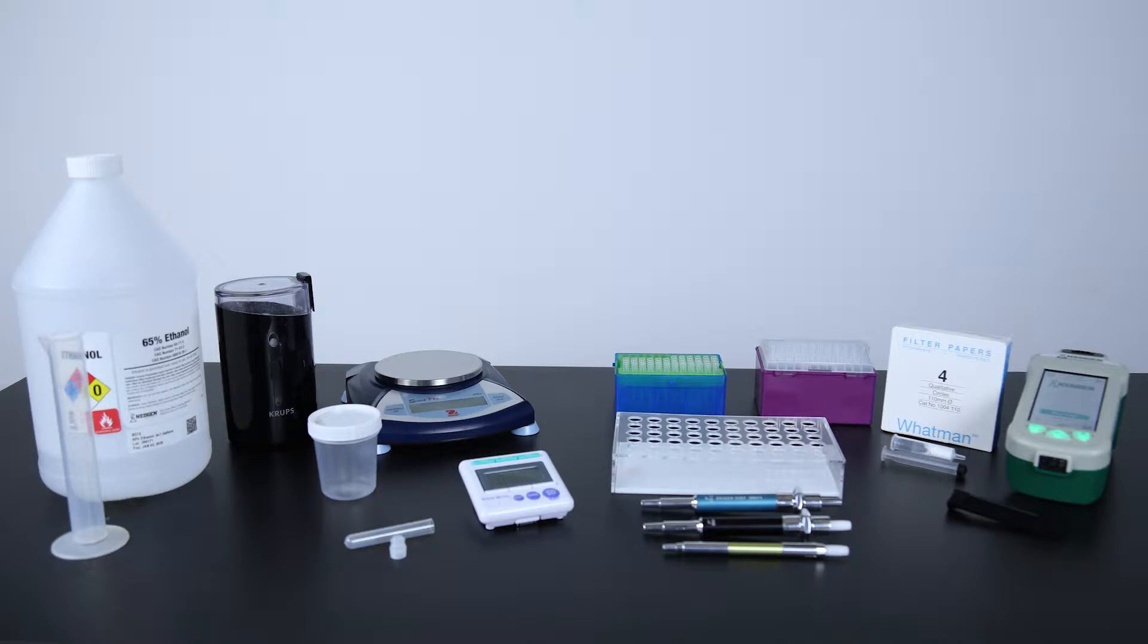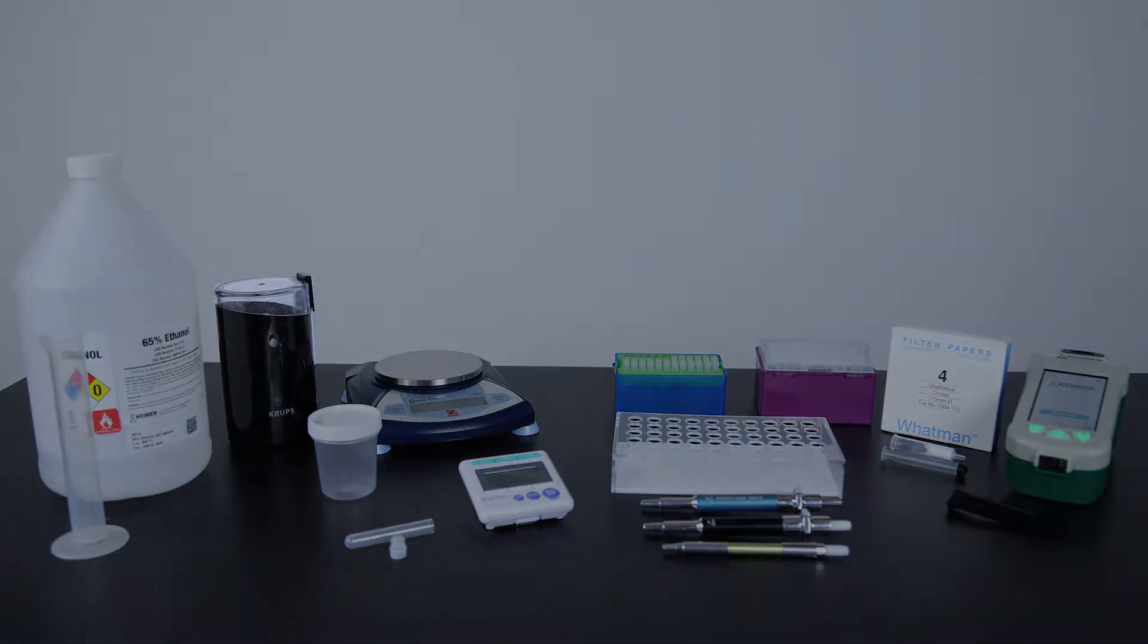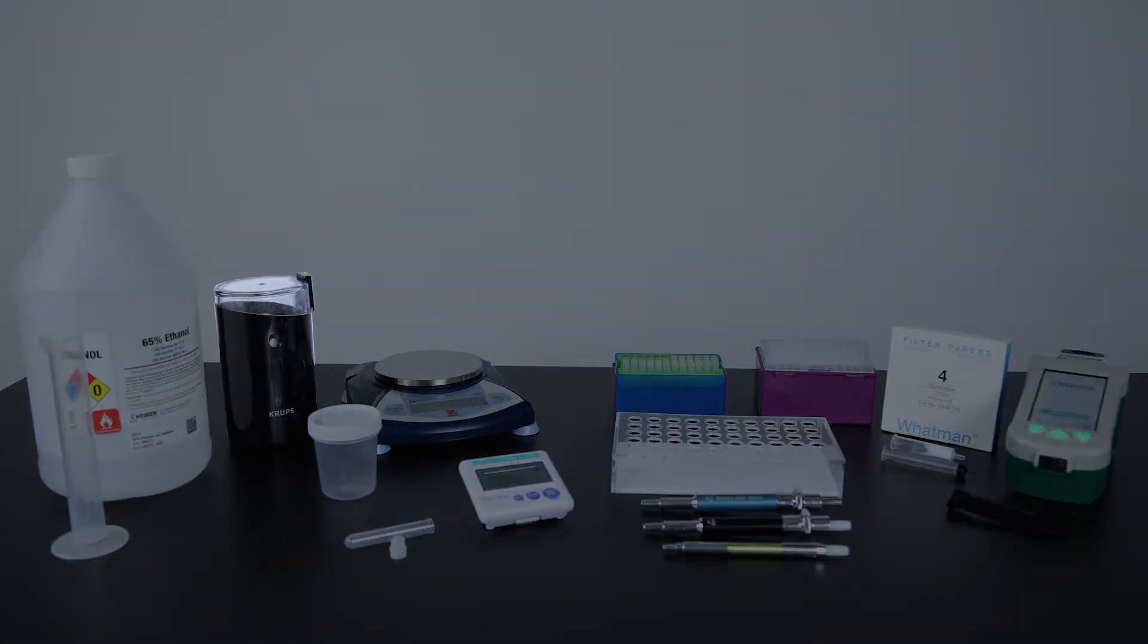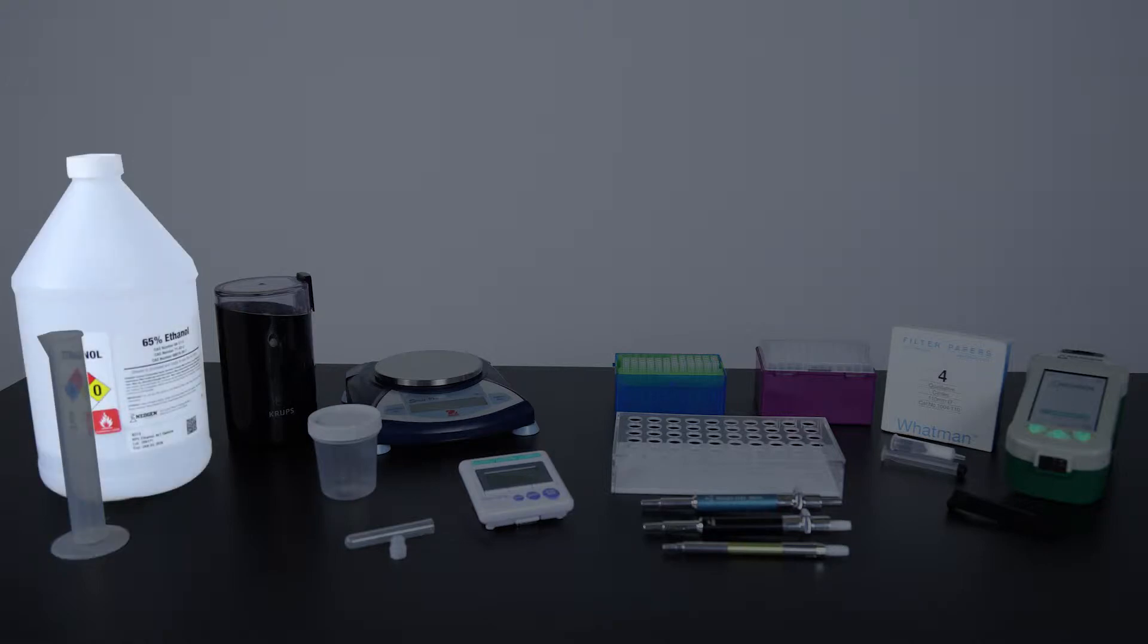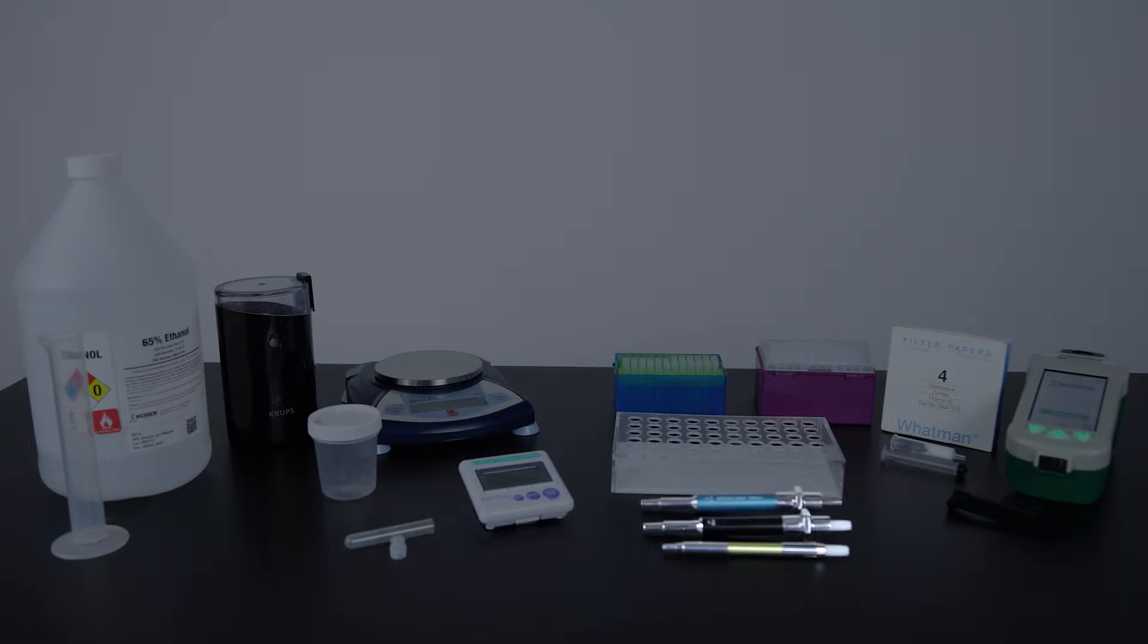To conduct the test, you will also need an Agri-Grind or equivalent grinder, a scale capable of weighing 10 grams accurate plus or minus 0.1 gram, a timer, a Reveal sample cup rack, 50 milliliter graduated cylinder, 65% ethanol solution, a 100 microliter, 400 microliter, and 500 microliter pipetter and tips.